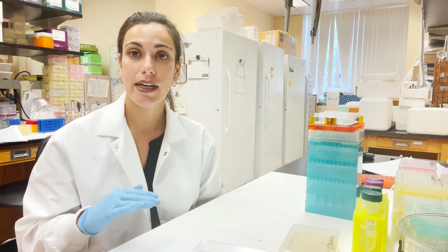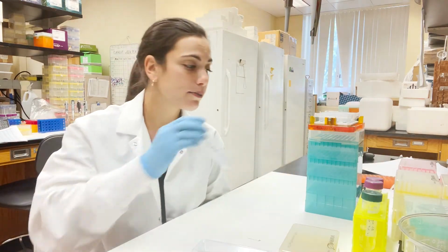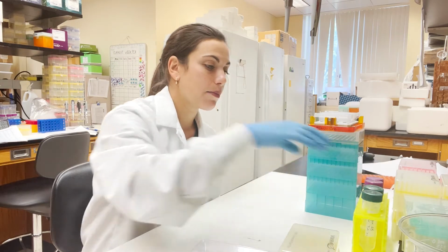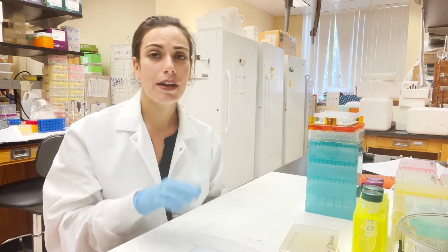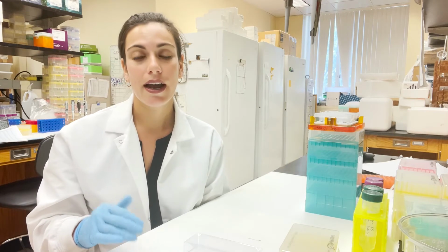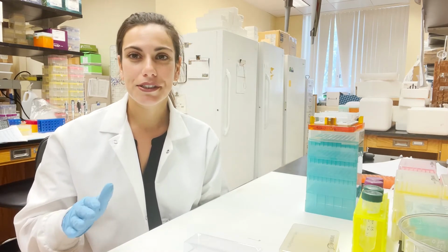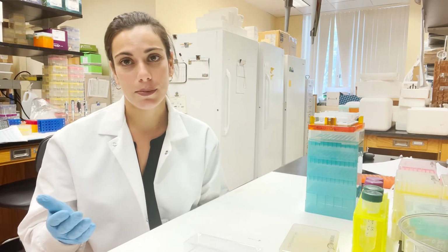We go through 3 ethanol washes with the 70% ethanol that we made outside of this video in the well. And then we have to remove all of that similarly to the way that we removed the supernatant. And then we allow it to dry completely because ethanol can really interfere with the next step, which is PCR.